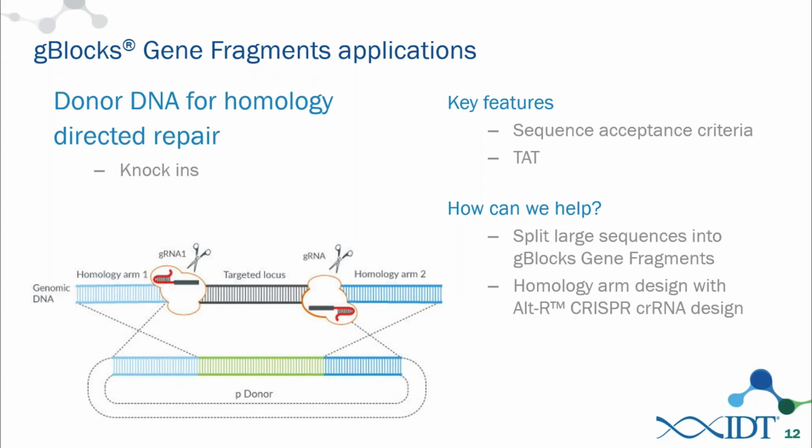As far as the stability goes, the stability of DNA is fairly consistent across the board. Single-stranded DNA has slightly lower stability than double-stranded DNA, and that's because there is some base protection that happens in the double helix of the double-stranded DNA. That being said, we've done a lot of long-term stability assays on our single-stranded DNA in the oligo form, and those are quite stable for up to years at a time. We expect nothing different from the single-stranded gBlocks.